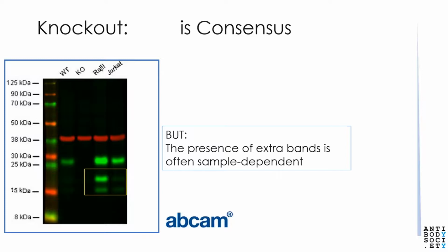wild-type HAP cells stained with an antibody, and the antibody sees a strong predominant band. And this band is gone in the knockout sample. And most people will agree that this is very strong evidence that the predominant activity of this antibody in HAP cells is the intended target.